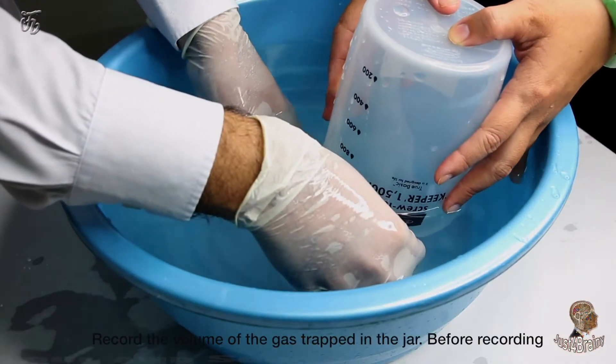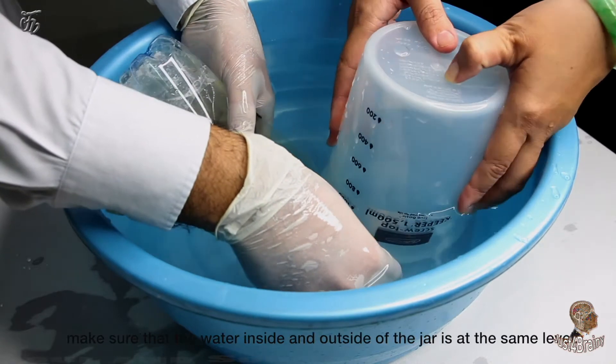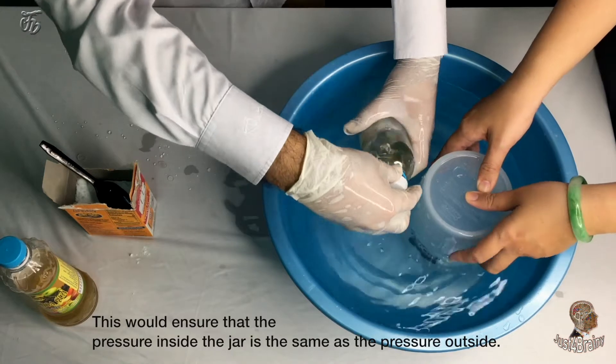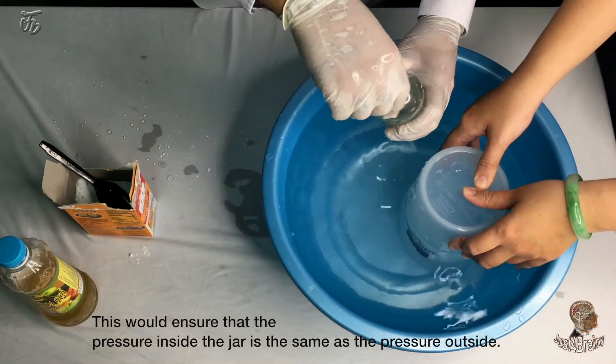Record the volume of the gas trapped in the jar. Before recording, make sure that the water inside and outside of the jar is at the same level. This would ensure that the pressure inside the jar is the same as the pressure outside.